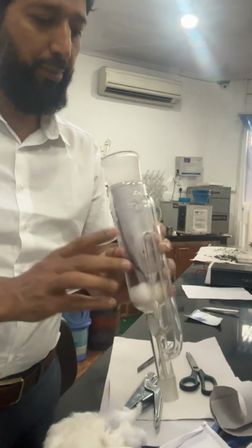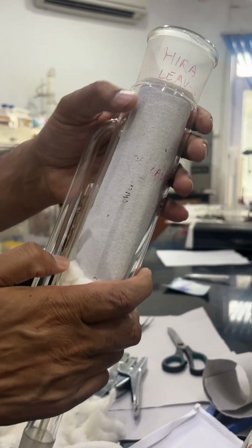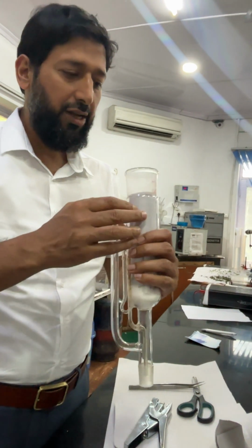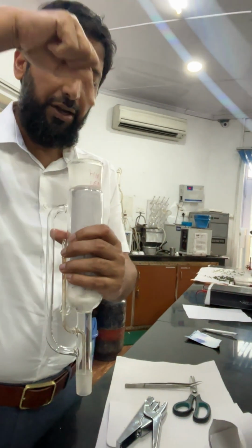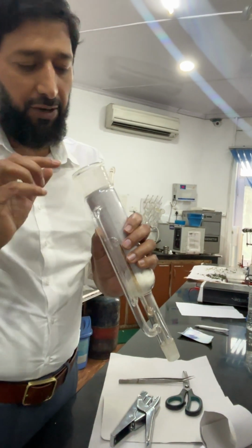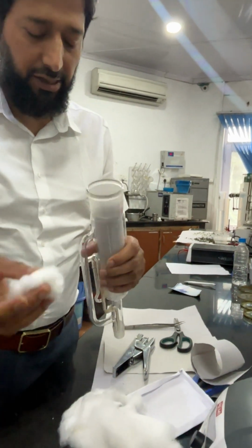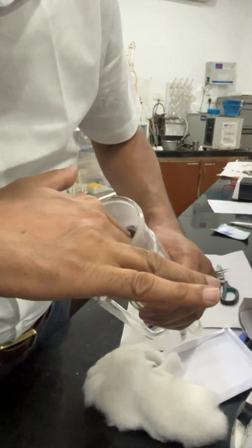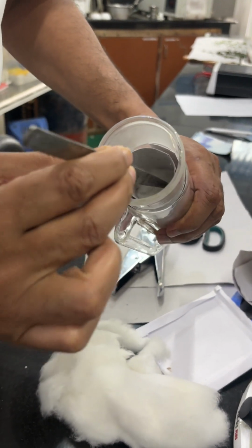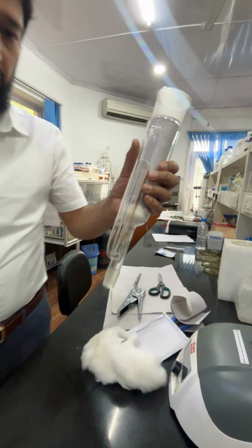So now your thimble has been packed in this Soxhlet apparatus, and you can see here for the solvent. When the solvent condenses, it falls drop by drop, and sometimes these particles come out. So to have a double protection, we take a little cotton piece and put it over this. Now it will not come out. So now we'll go to the Soxhlet room.